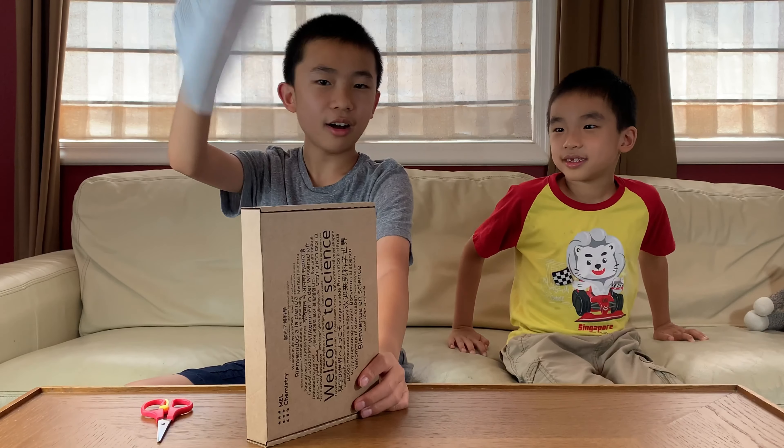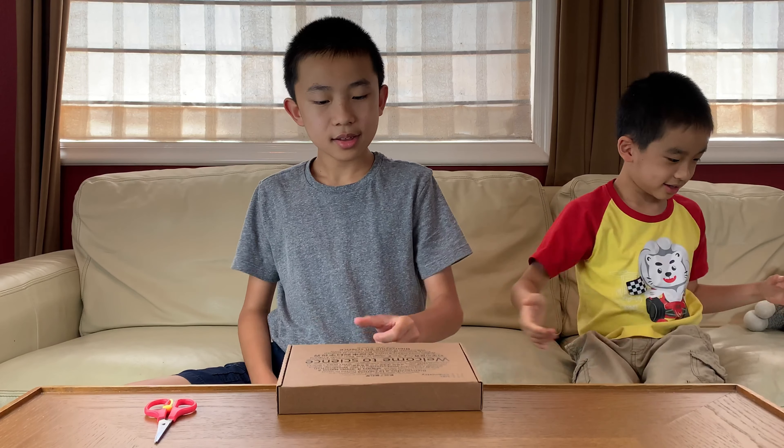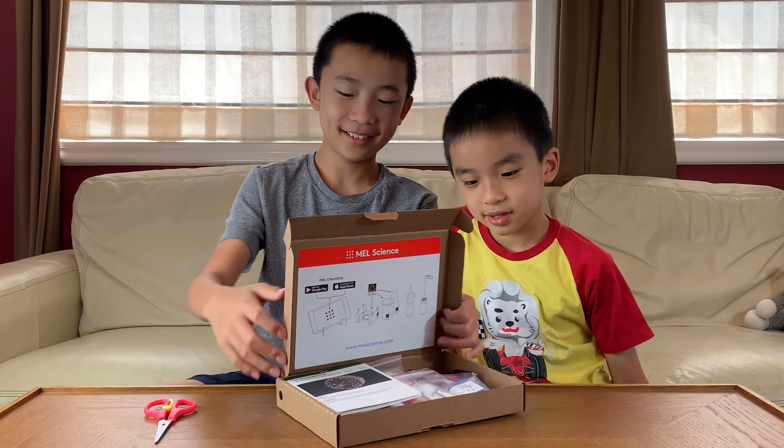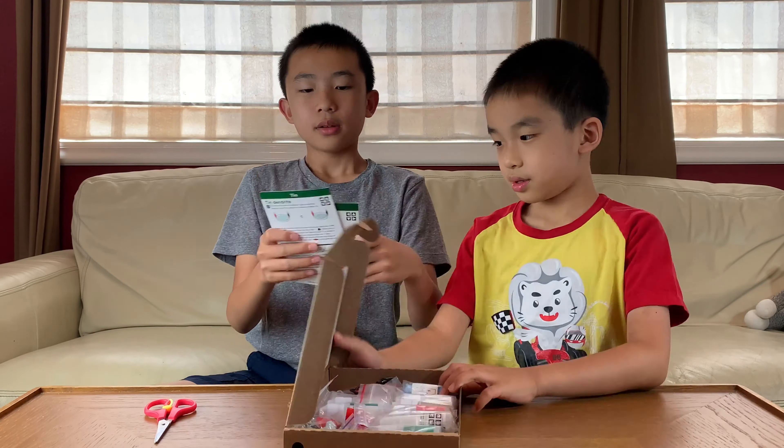Got the lid off. It says welcome to science! We can see the two experiment cards inside, and each one is for one of the experiments.